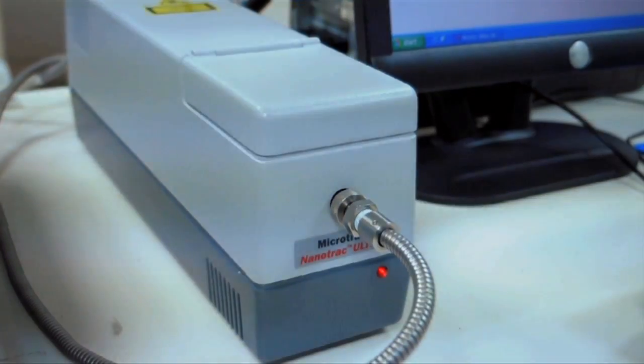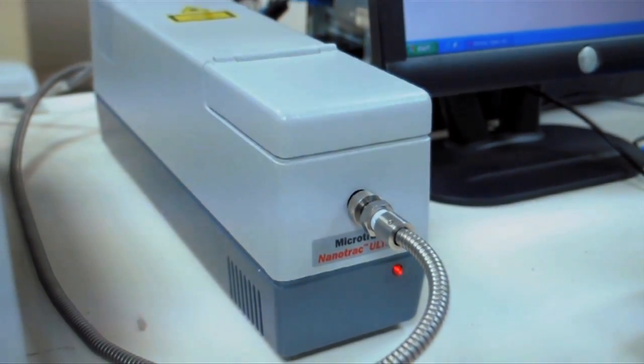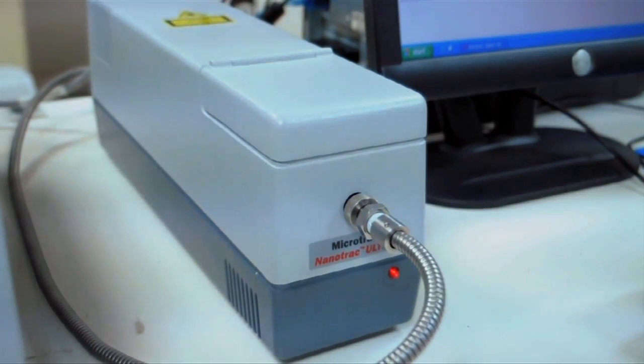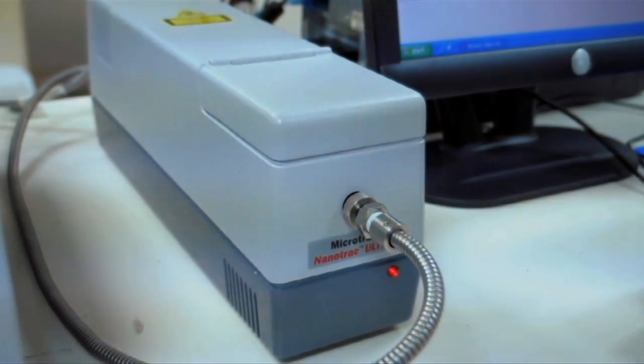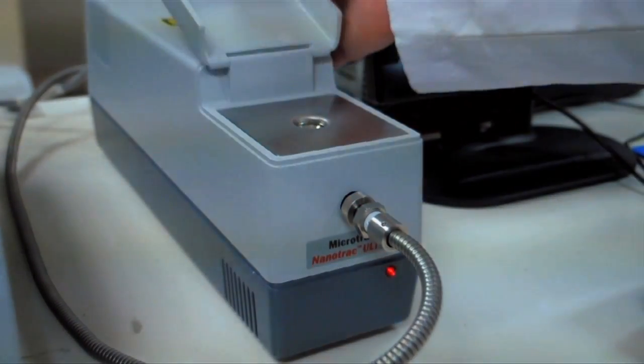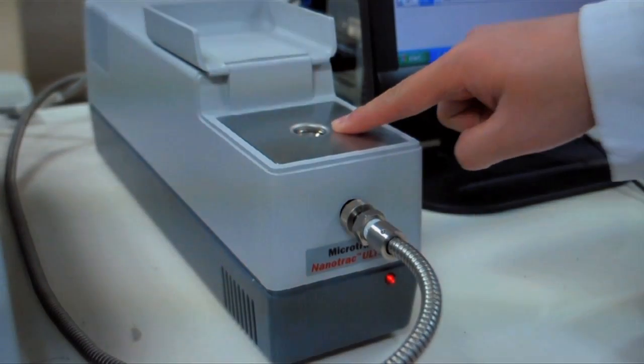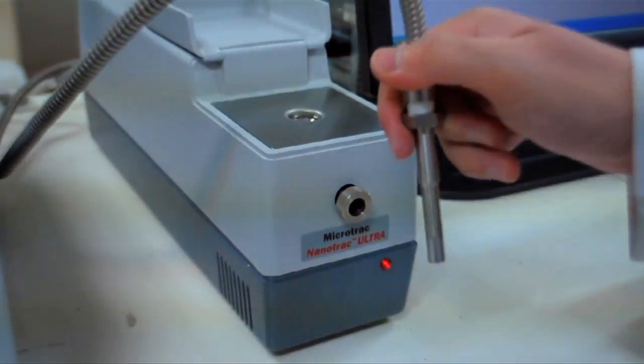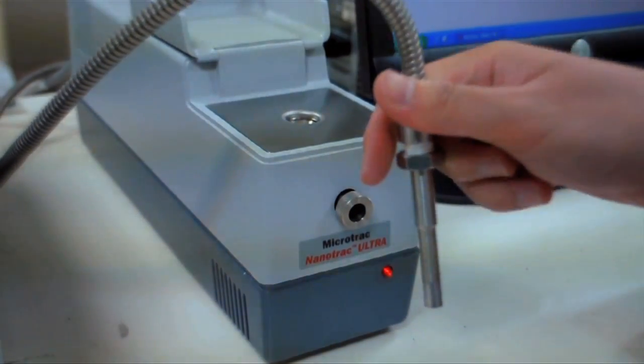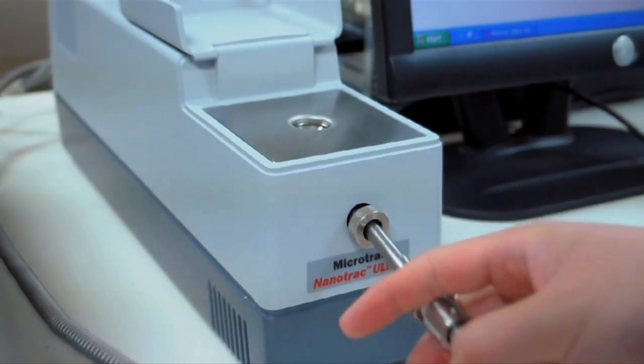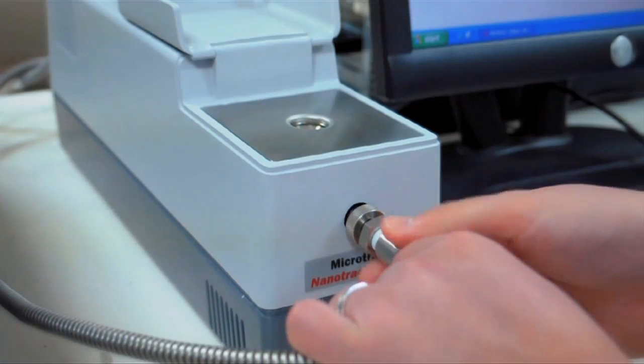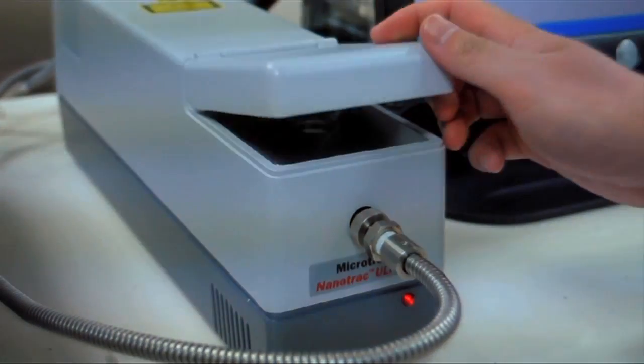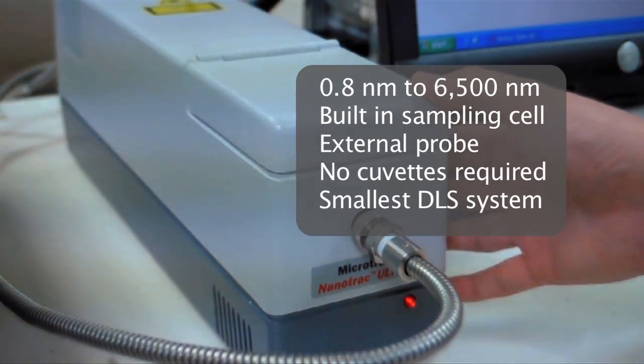Once again, this is the Nanotrack which is a particle size analyzer for nanoparticles. It has a size range from 0.8 nanometers to 6.5 microns. You can use the built-in sampling cell or you can use the external probe. You do not need to use consumables such as cuvettes. The Nanotrack is the smallest dynamic light scattering system in the world.